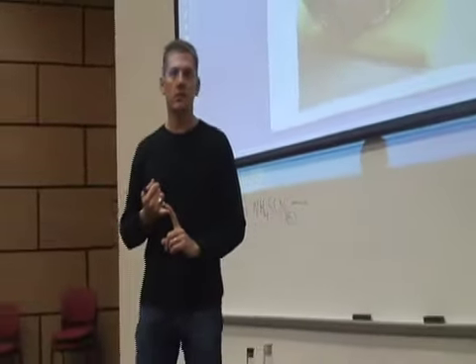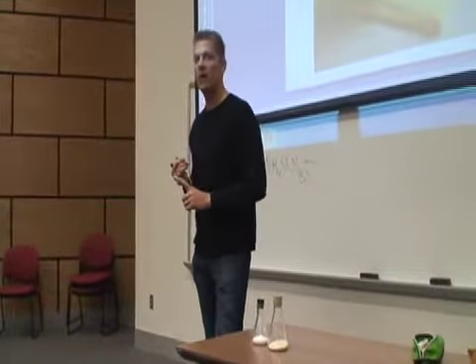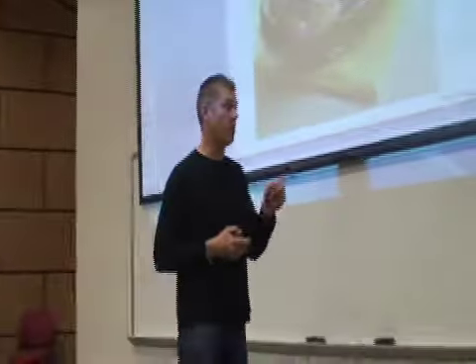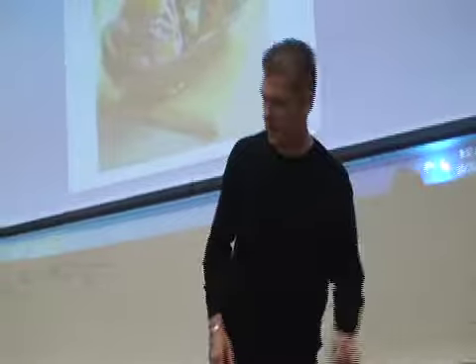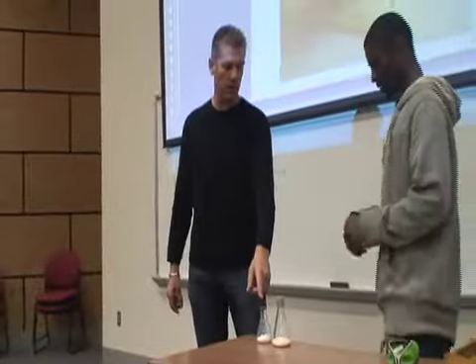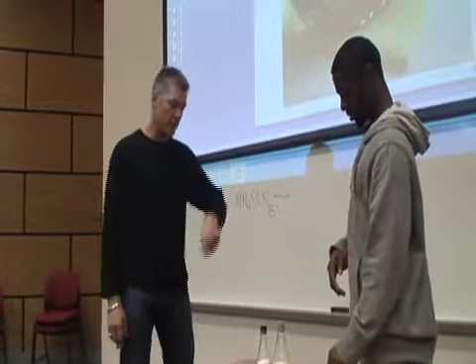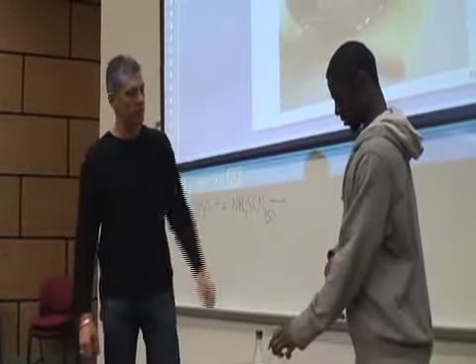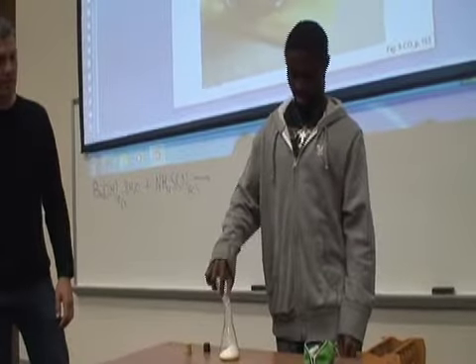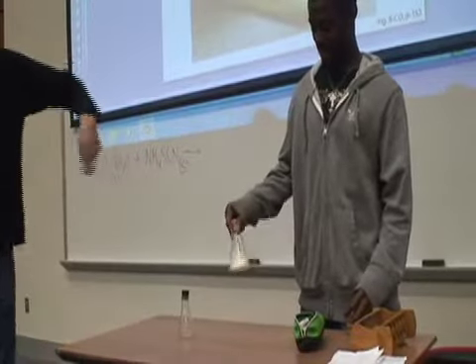Your title should be 'Cold Bottle Experiment' — cold. That may become apparent as we go on. What you're going to do is take these two solids, pour the little Erlenmeyer flask into the big Erlenmeyer flask, re-cork the big Erlenmeyer flask, and just kind of swirl them and stir them up. Give it quite a vigorous stir.